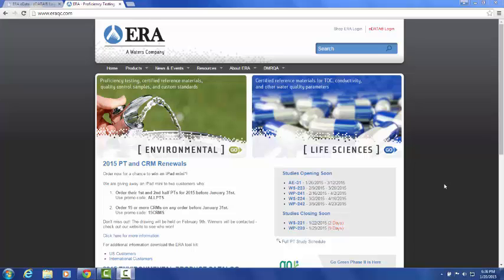About eDATA. ERA greatly improved our customers' PT experience when we first introduced the innovative eDATA portal in the early 2000s. Over time, updated features were added in response to customer needs and changing requirements, which added some complexity for those navigating the site.